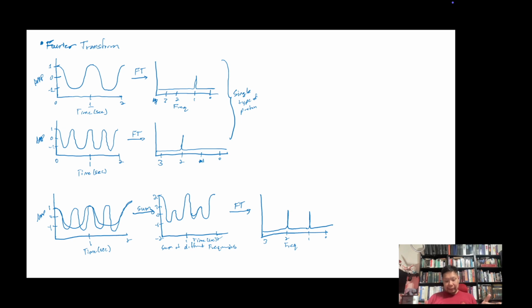And so now you can imagine if you had a molecule that had a whole bunch of different types of protons on it, in different proton environments, chemical environments, they would have a crap ton of overlapping cosine waves that represent their individual precessions, that induce the current in the RF coil, right? And all those different cosine waves would overlap on each other, becoming this big jumbled mess of lines, and you would never be able to know what it is, right? And they all get condensed into this sum of all of the different frequencies. And so the magic is that the Fourier transform is this mathematical operation that can deconvolute all of that data, right, into giving you very useful information, like all the frequencies that are available within that summation of all the different frequencies.